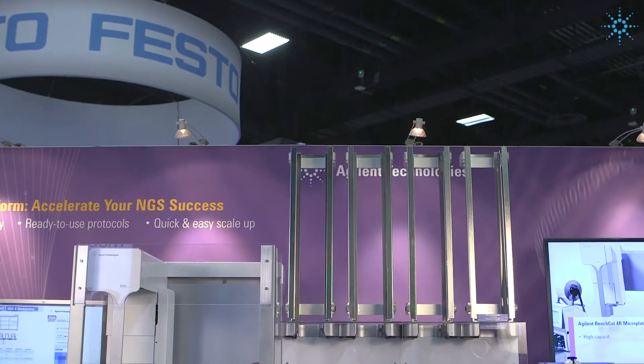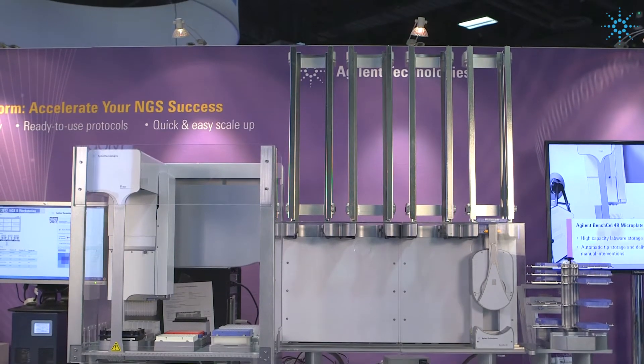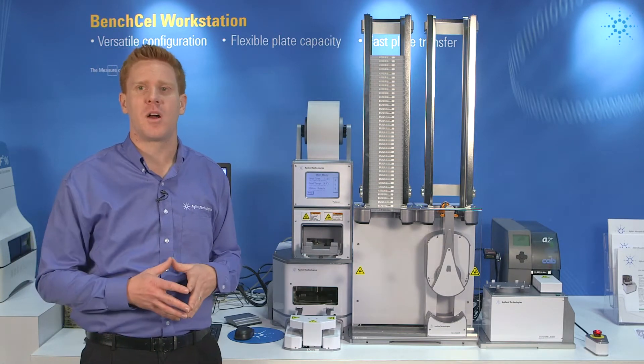Beyond the Bench Cell system, you can also integrate in the Agilent Bravo liquid handling platform, which enables you to do more advanced applications like high-throughput screening, plate stamping, and serial dilution. Having the ability to have pipette tip boxes racked in the system enables you even more walkaway time.